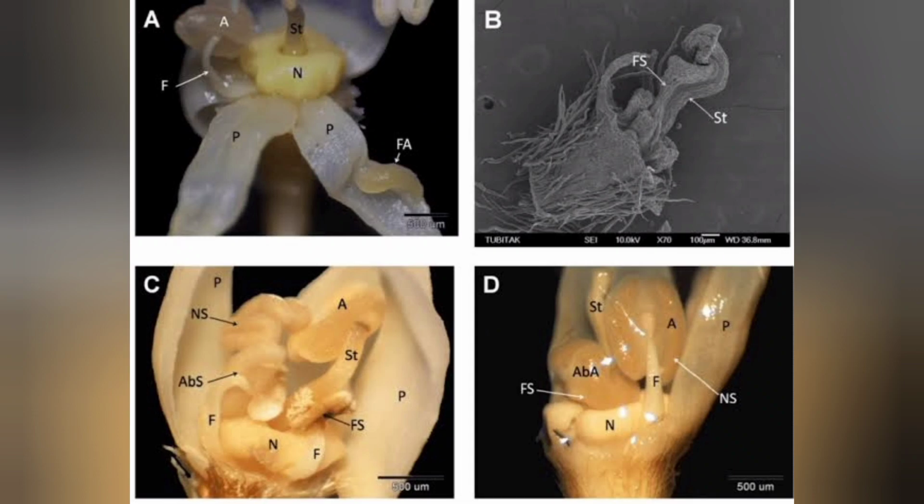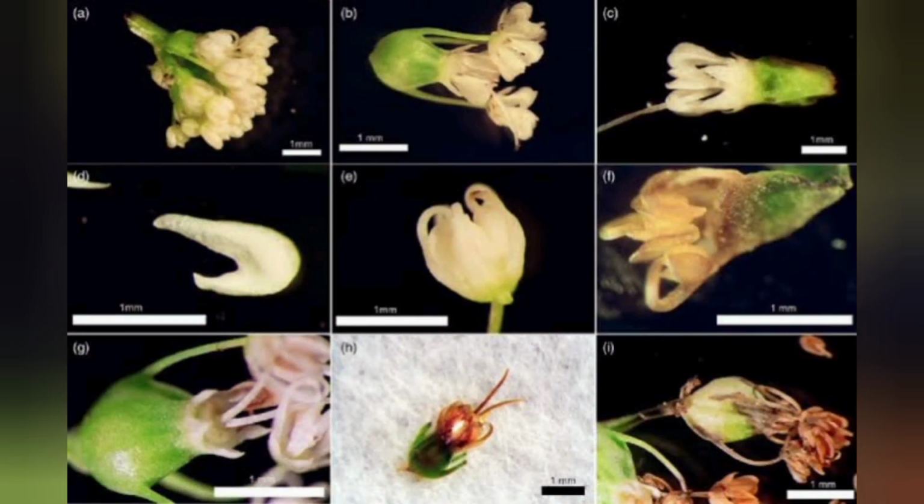These two different light paths now create a three-dimensional view for the eye. Because of this, it is mostly used to examine thick or solid objects.